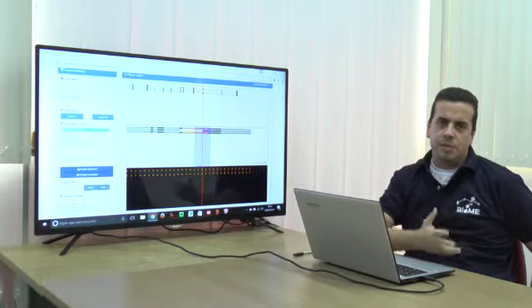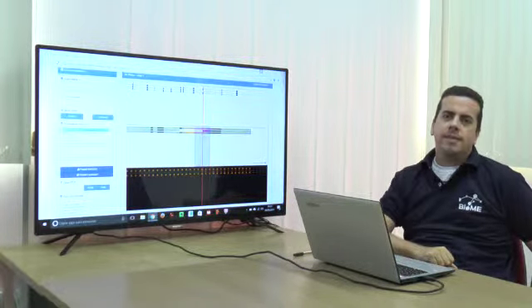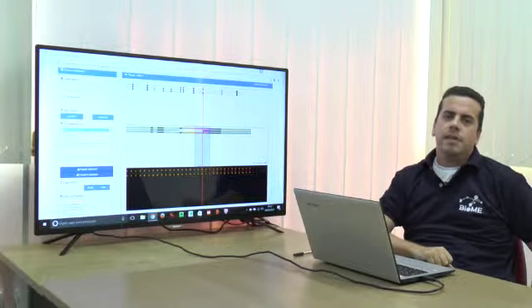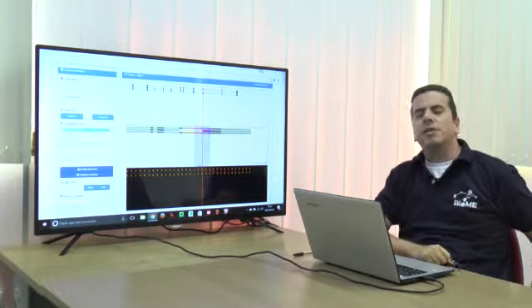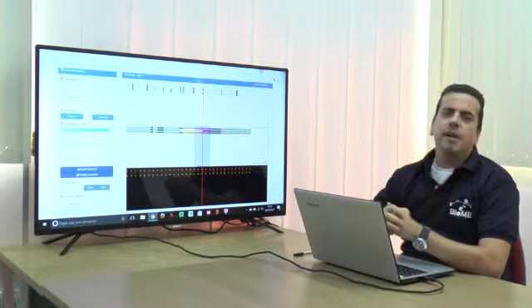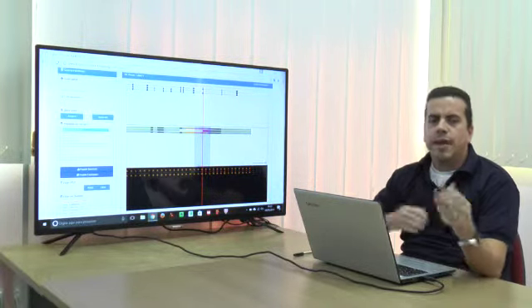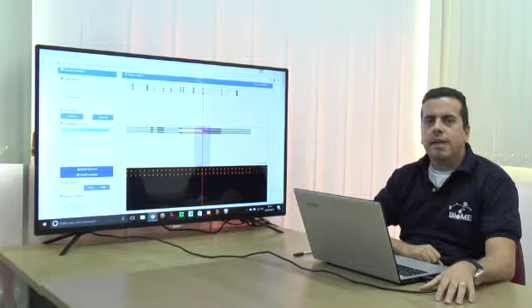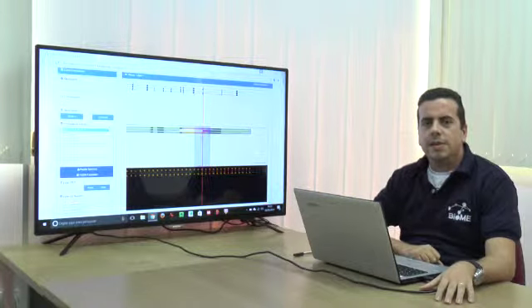The tool itself is divided in two parts. Of course, you have the script itself in Perl, and that is going to be mostly used by the people that want to upload their own data. The kind of input it accepts is TXT files, which you can get from your peptide search engine, or you can also use mzid files from the PSI standard from the Human Proteome Organization.